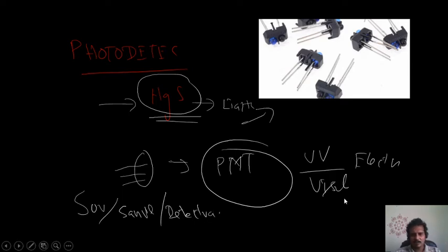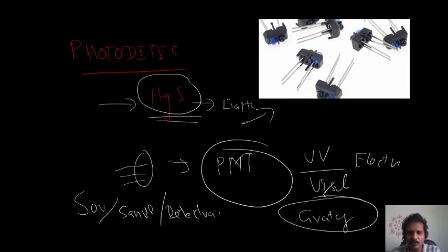Again, you can use a modulator, and a grating will come. You have a grating here that will be used. All the gratings we have seen already. I'm not going to touch upon that.